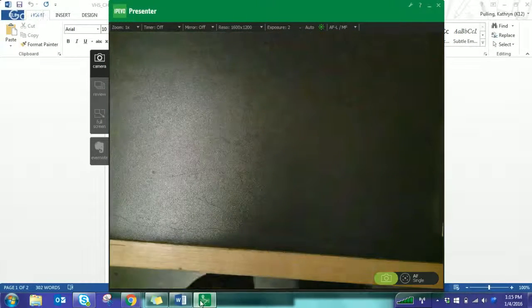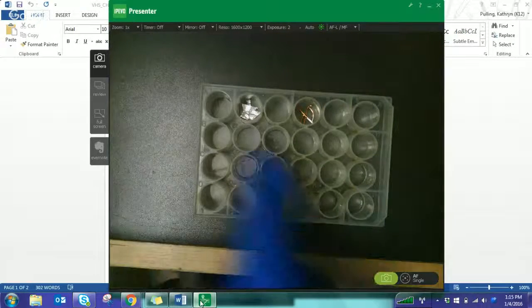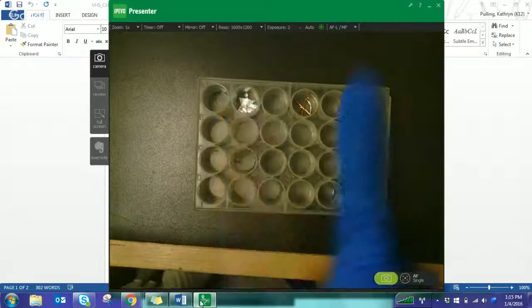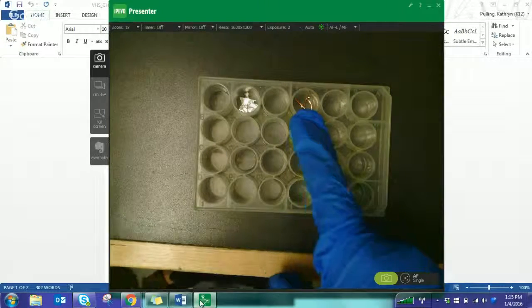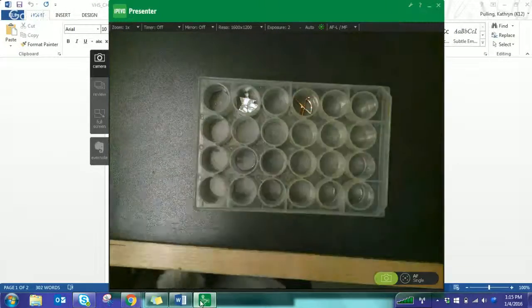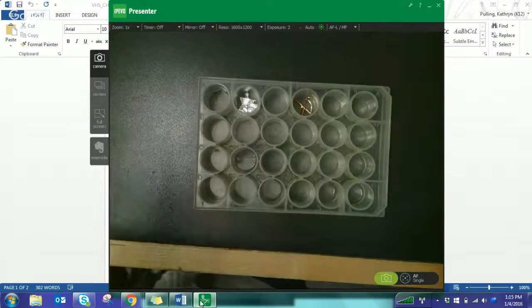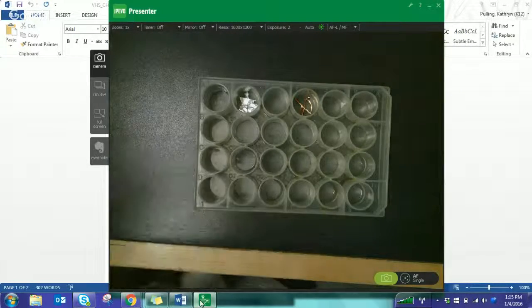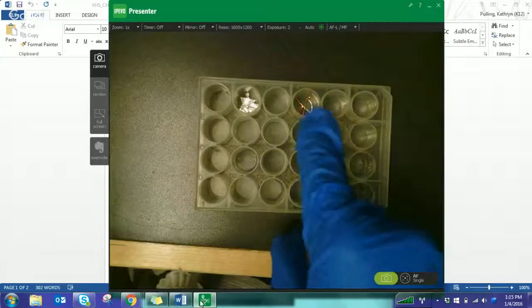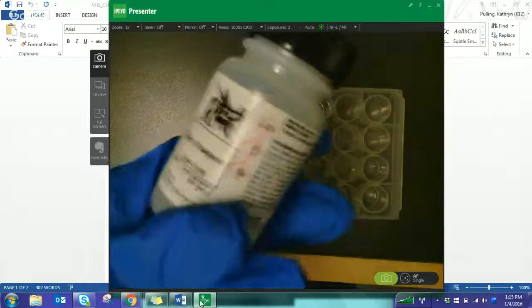So, part 2, you're going to need a well plate. I've already put in some of the things. So this was foil from the house. In your kit, there's a larger amount of copper wire, like a spool of it, or kind of like several rings of it. I just cut a little bit of that off, because you're going to need the rest of that, and you're going to need a decent amount of it for a lab in Chemistry B. But I just took a little bit off of that for this part of the lab. And then you need zinc powder.